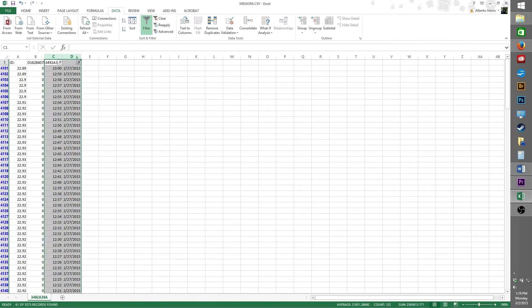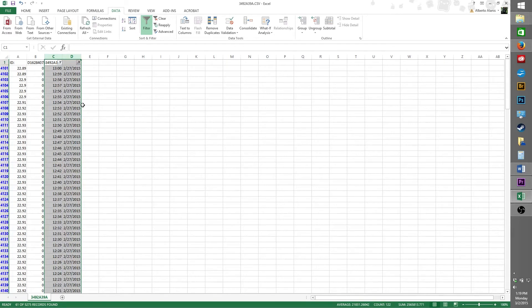Once you have done this, column C and column D will be both filtered together, showing only temperature ranges that occurred on February 27, 2015 between 12 PM and 1 PM.